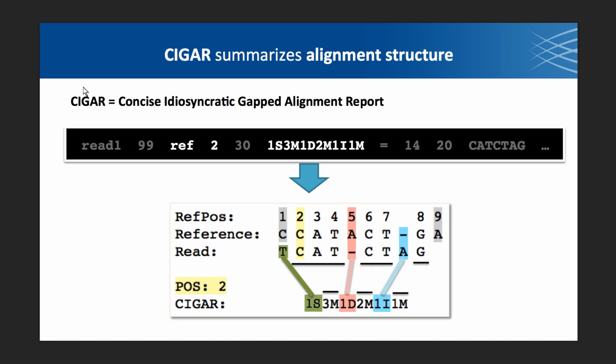Then we have 3 matches. And then we have a deletion. That's what a deletion looks like. There's just no base here. Right? And then we have another 2 matches. And then we have an insertion. So we put a gap in the reference to illustrate that.